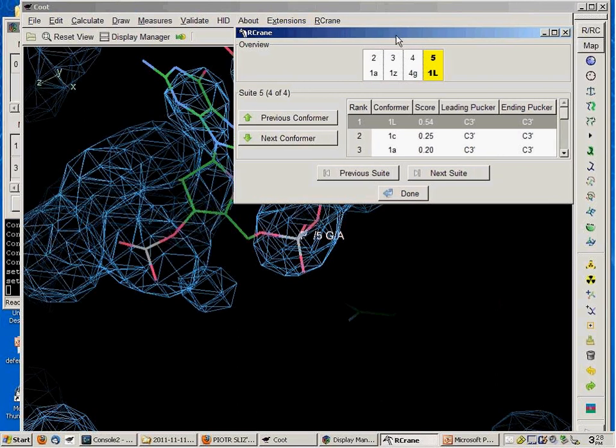And the score itself, is it calculated based on the geometry or the density fit, or both? Purely geometry. Yeah. It's calculated based on a mapping between the pseudotorsions and the backbone conformers, and based on the P-perp distance for how well it matches the sugar pucker.